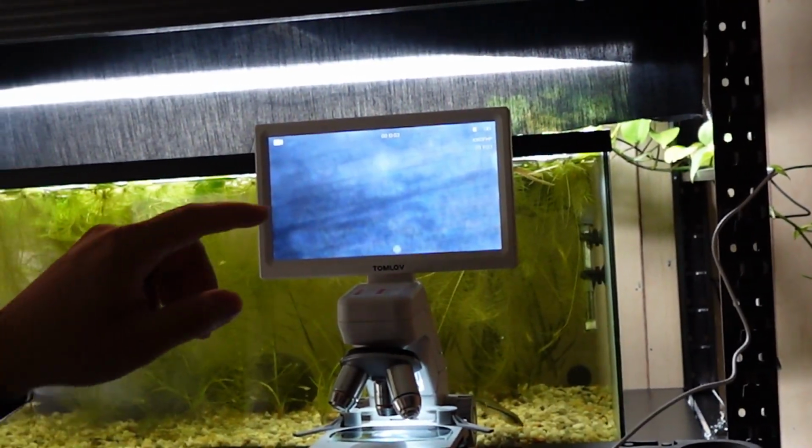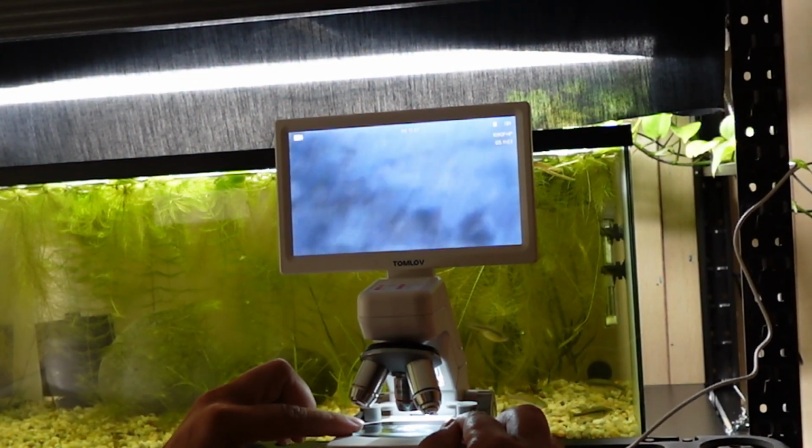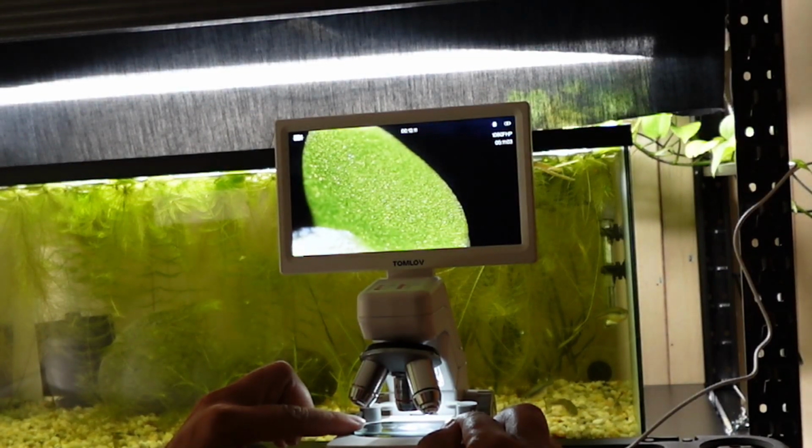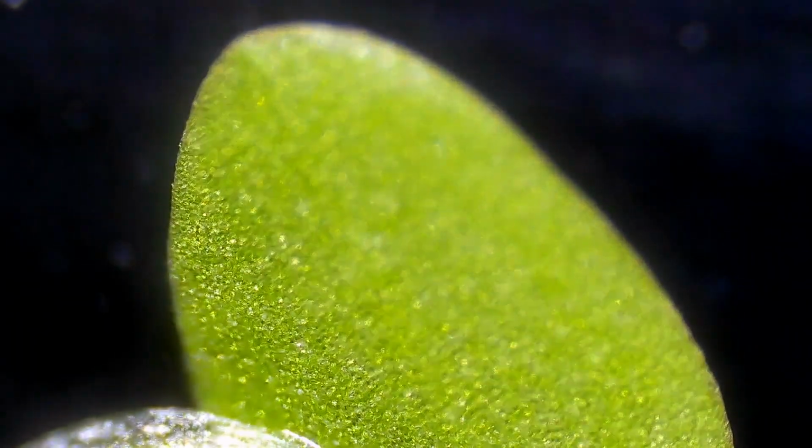Look at the LED, look at the screen here. I'm just gonna slowly push it into focus here. All right, any guesses? Can you guys guess what this is? It's green, it's round, oval-like, and that's the rest of it.